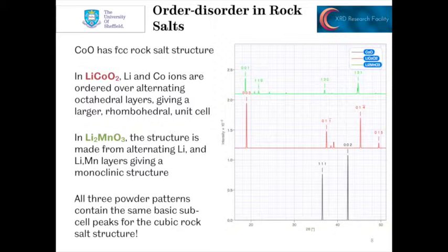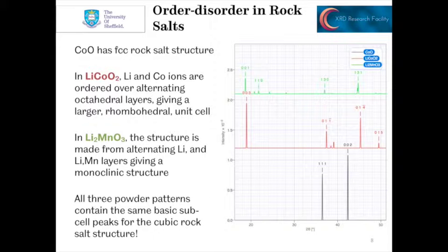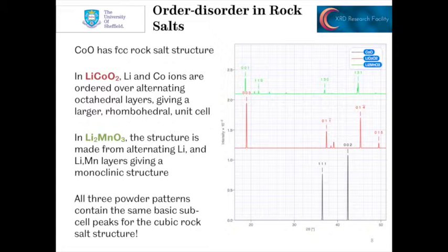In lithium manganate, Li₂MnO₃, we can see the diffraction pattern here in green. This again is a layered structure, but we now have fully occupied lithium layers alternating with layers which contain a mixture of lithium and manganese, ordered as you go through the structure. The structure is now monoclinic, and we can see extra reflections as a result of the reduced peak overlap. We still get the basic subcell peaks for the cubic rock salt structure, but again they're shifted to a higher angle, and we see a lot of extra reflections because of the reduction in symmetry and peak overlap.